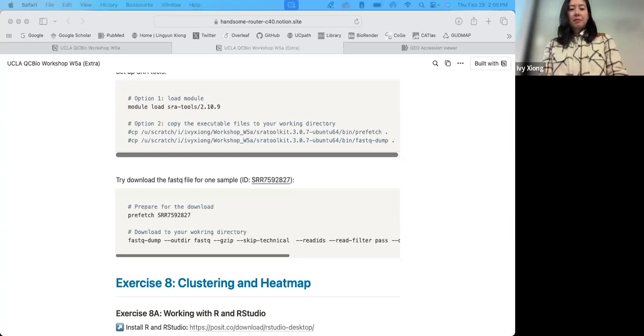So it was downloaded successfully. It has 0 unresolved dependencies.